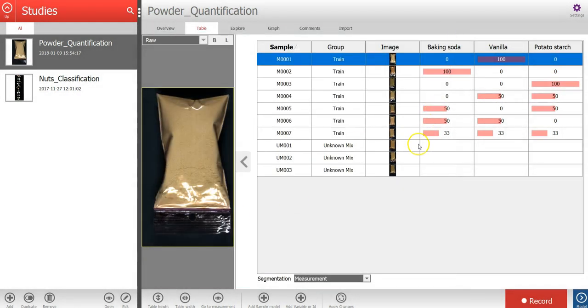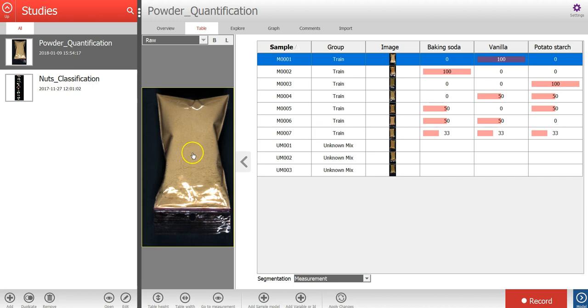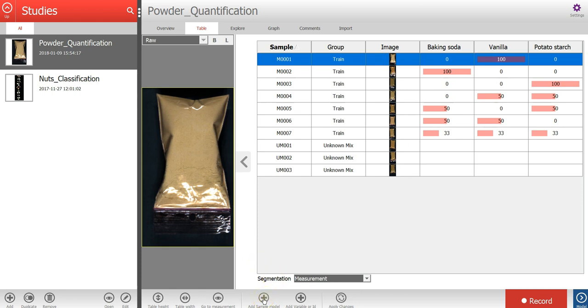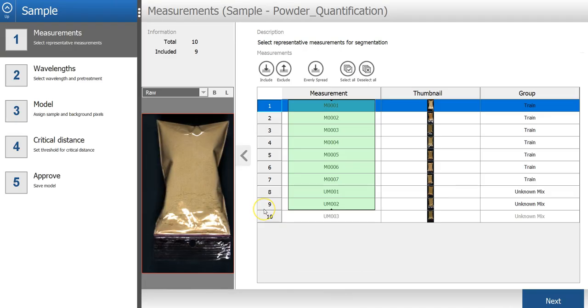Now let's create a sample model segmentation to remove the background pixels and to automatically identify the sample objects in our images. I will press the add sample model button located under the table.